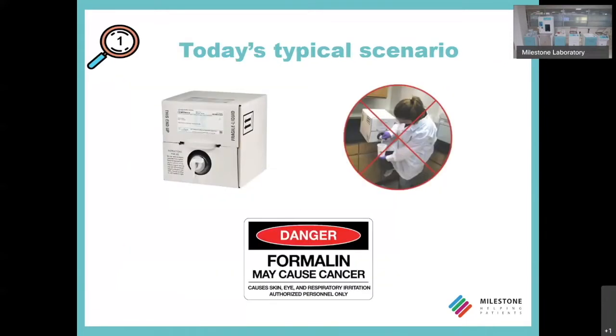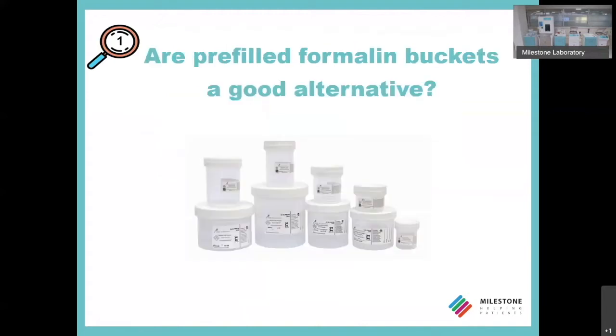So situations like this one, seen in the circle, where a nurse in the nearby dirty room in the operating room center manually pours formalin from a container into a plastic bucket where the biospecimen is present, are not possible anymore. Some groups of pathologists or operating room nurses adopt what are so-called pre-filled formalin buckets.